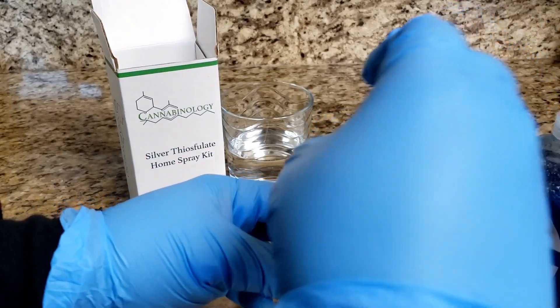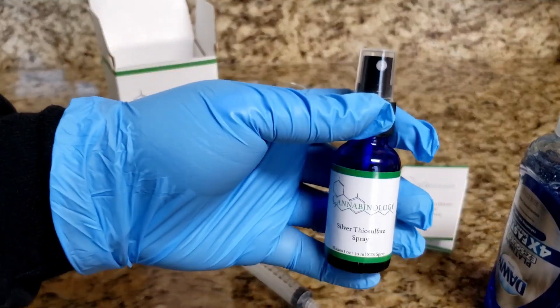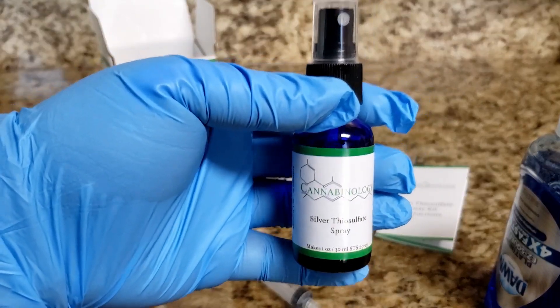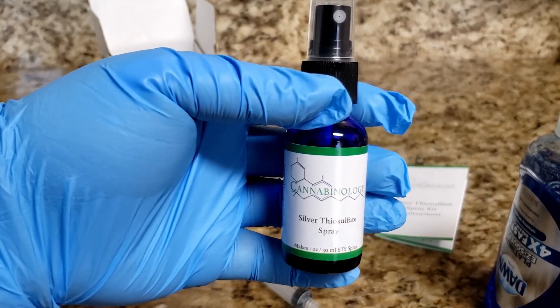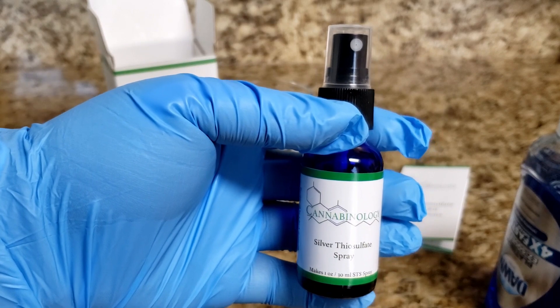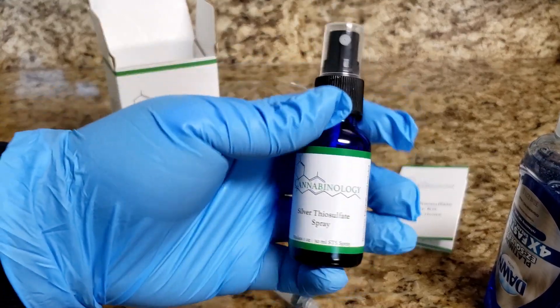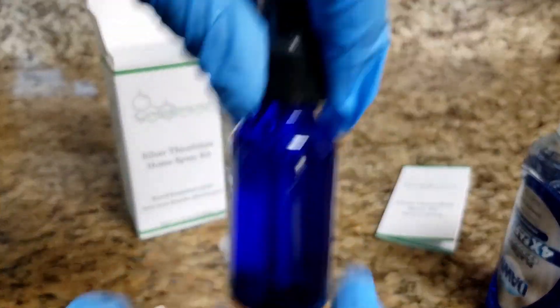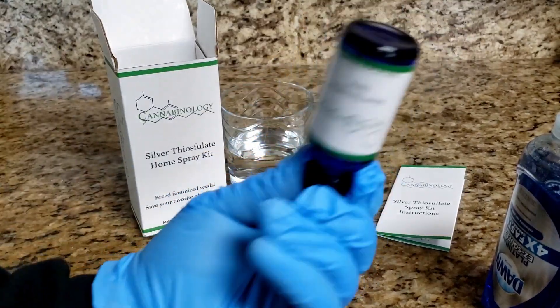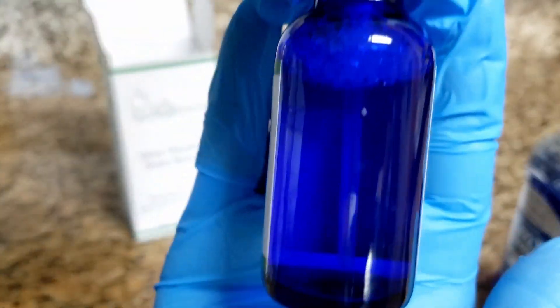Then we'll go ahead and put our cap back on. In the instructions, we do say to mix by swirling, and that's because if you shake this very vigorously you're going to get a lot of bubbles because of the soap, and the spray action is not going to work as well — you're going to get a lot of bubbles coming out of the sprayer. So you want to make sure that you swirl to mix so that the soap dissolves into the solution but doesn't make too many bubbles. When I mix, I usually just go like this. You can turn it upside down and give it a swirl as well. As you can see, there will be some bubbles, but not too many.